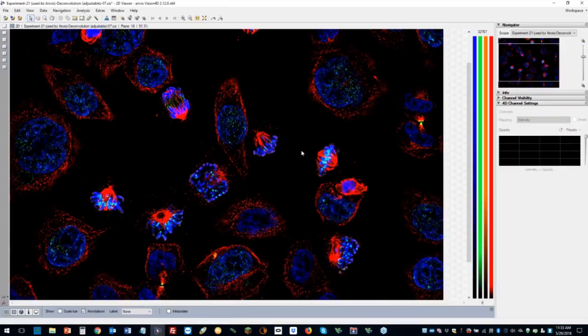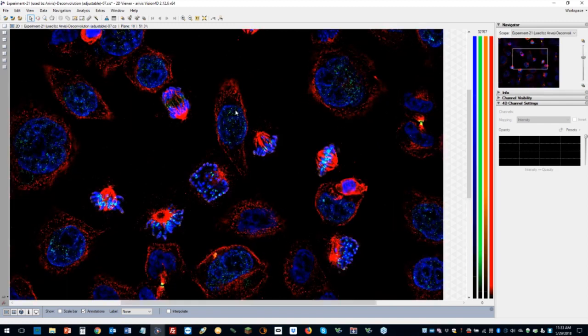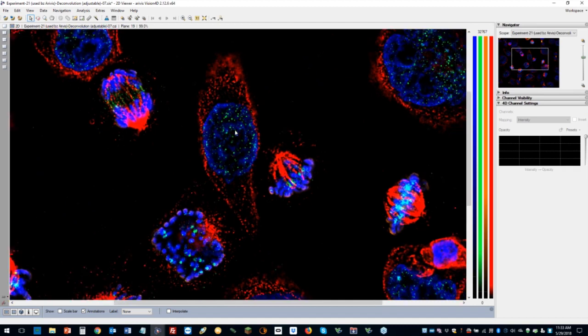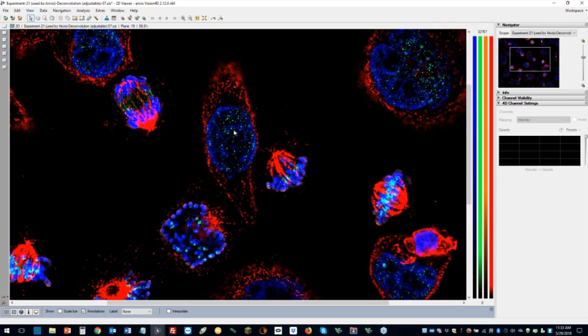This is pretty, I like this one a lot. So we have this absolutely gorgeous image here. We've got multiple color channels, and we can explore through the planes, and we see it's absolutely beautiful. We see some chromatin material is labeled in blue. We see something labeled in red, which I would presume is something associated with the cytoskeleton. We see a bunch of little green dots. These are associated with proteins on the chromatin that are involved in the splitting of the cells.